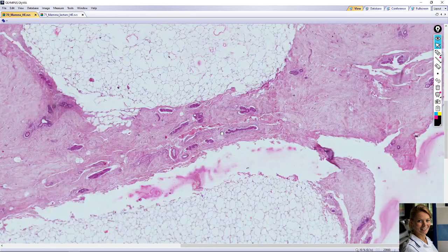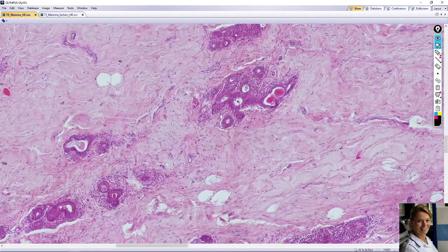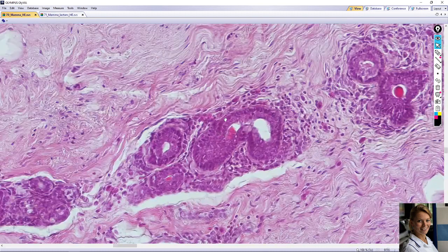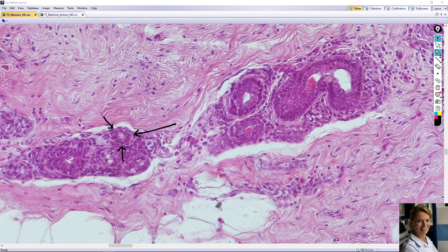A glandular lobe consists of small tubules or intralobular tubes, no ducts, here, which are lined with a cuboid or low columnar epithelium. At the base of the epithelium are the contractile myoepithelial cells, which have flattened darker nuclei here and here — the myoepithelial cells.